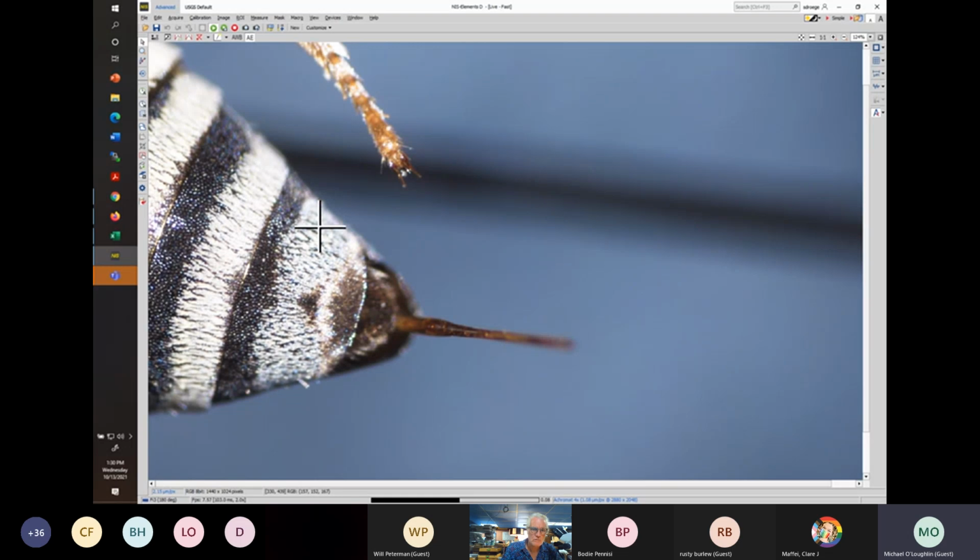So these are just white appressed hairs, similar to the ones on other segments. And on Triepeolus too, these would usually be surrounding the pseudopygidial area. And here we see that it's relatively broad, and the length is about half the width of the pseudopygidial area. What makes this different is these hairs are modified and different in presentation.